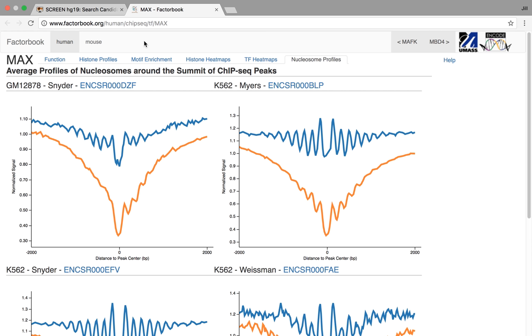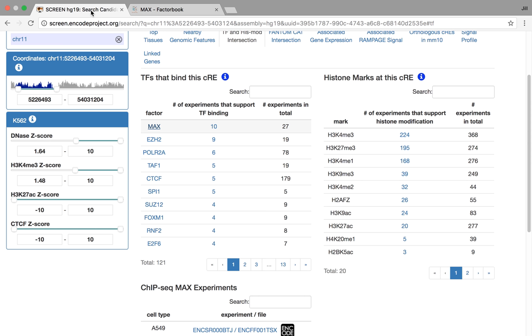As you can imagine, the CREs and the motifs are very important, they're very deeply interrelated and very important, so one of the things I'm working on now is integrating FactorBook deeper into SCREEN. But as a separate tool, at least it stands alone right now and lets you investigate some things.